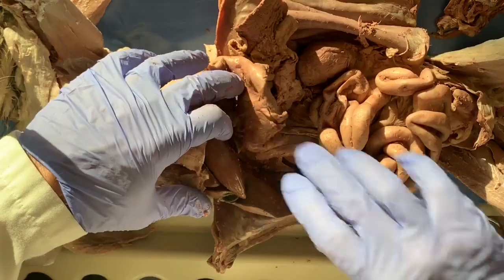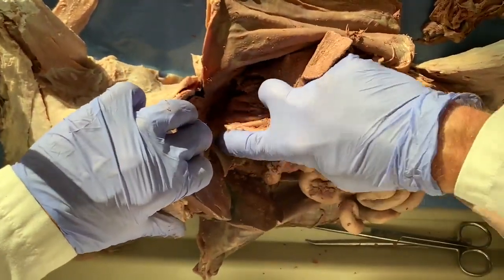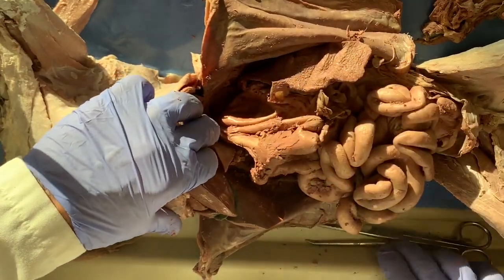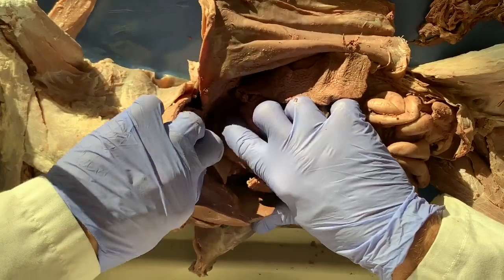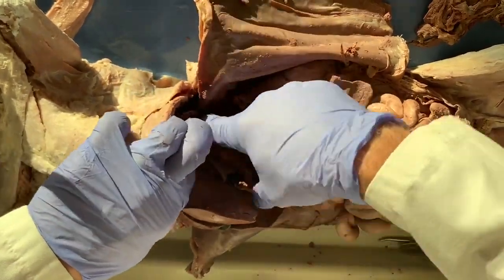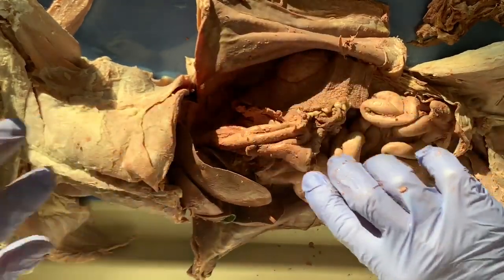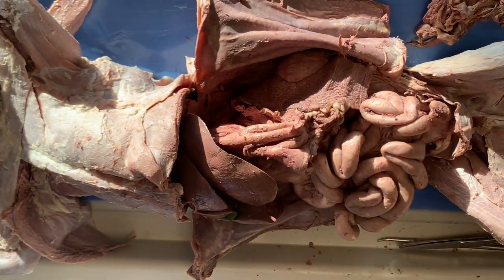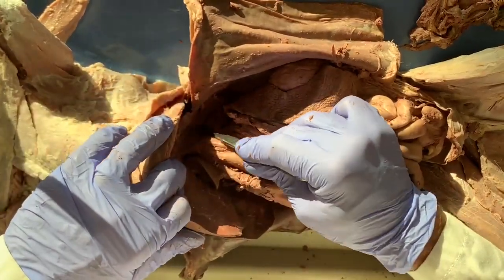And then I'm going to trace the stomach up into the diaphragm, and I have to perforate the diaphragm and find where the esophagus empties into the stomach. So I'm going to use the scalpel, just to make it a little bit easier. So find the edge of the stomach.